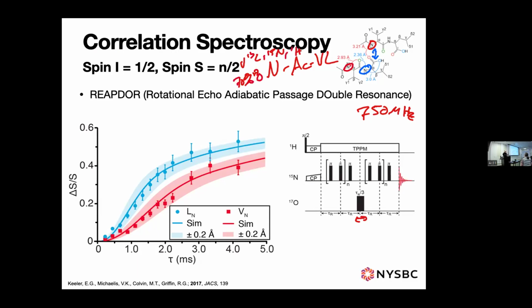So it being 70%, I'm a nitrogen and I'm looking out at my oxygen, so sometimes I have that one, sometimes I have both. Is that all baked into these simulations? Yeah, you have to put a scaling factor based on the percentage of labeling. It's cool that it's possible. That's why they don't go all the way, because these are pretty strong.